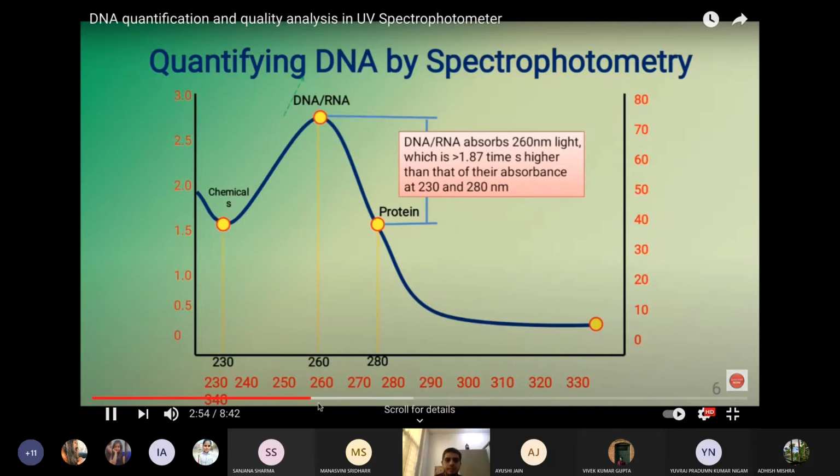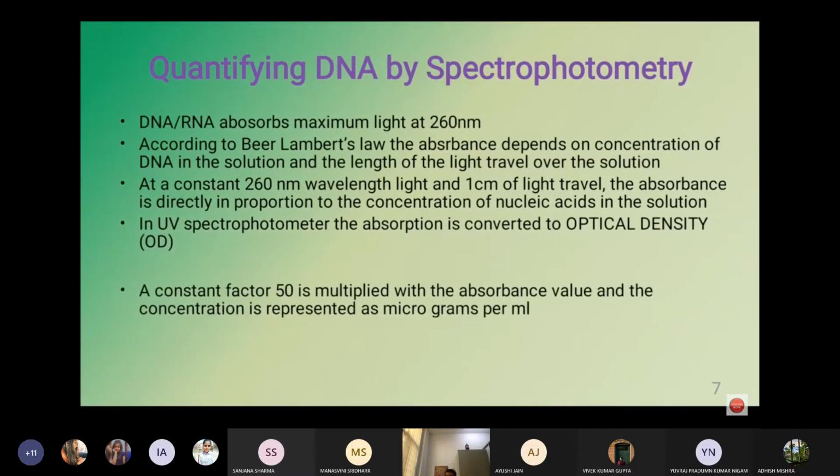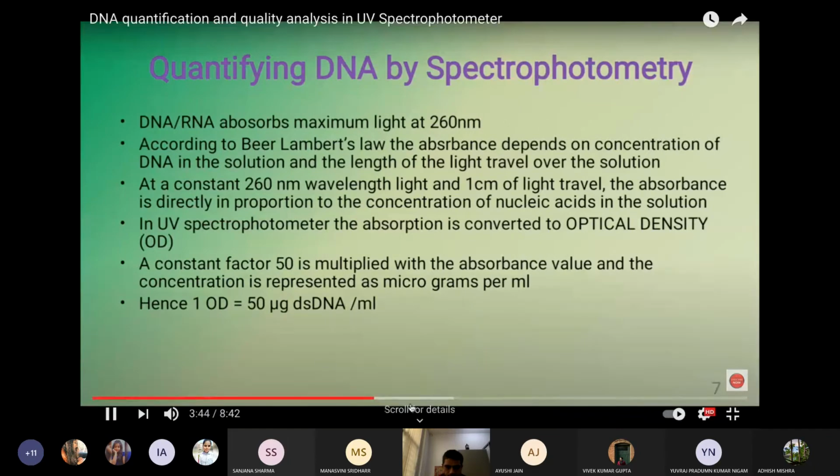So this criteria is considered while using spectrophotometry and its basic principles. The nucleic acids absorb maximum light at 260 nanometer, and according to Beer-Lambert law, the absorbance depends on the concentration of the DNA and the length of the light path traveled in the solution. At a constant 260 nanometer wavelength, make the light travel 1 centimeter of the solution. By this principle, the DNA concentration in the sample will be a variable and it helps to quantify the DNA. In a UV spectrophotometer, the absorption is converted into an optical density value and it is connected to a computer. The computer automatically calculates and converts the optical density value into DNA quantity.